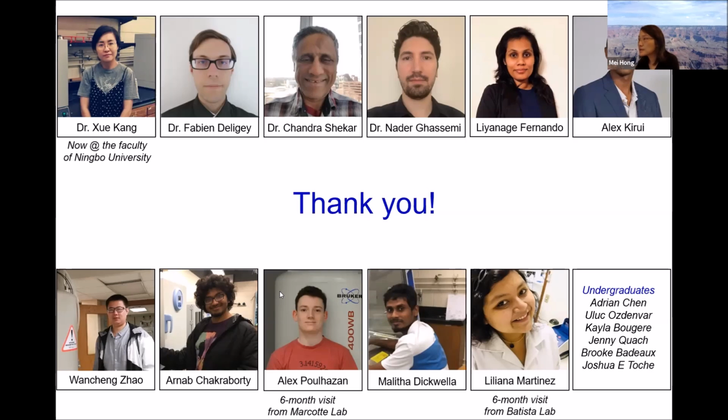So let me ask a question. Have you compared the relative merits of 2D INADEQUATE spectroscopy versus potentially 3D carbon correlation in terms of the resolving power and information content for these materials? We haven't measured a 3D spectrum on the fungi. We recently measured some 3D on the plant. The key point is that if we can resolve them very well, we don't need a 3D. But for the 3D, we use it more for structure determination, to get long-range correlations.